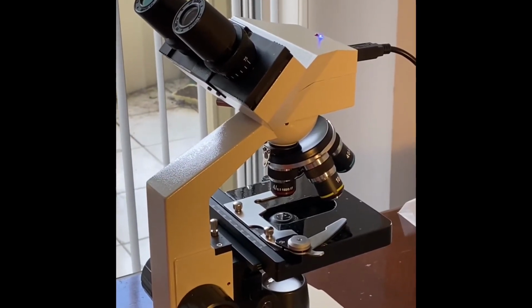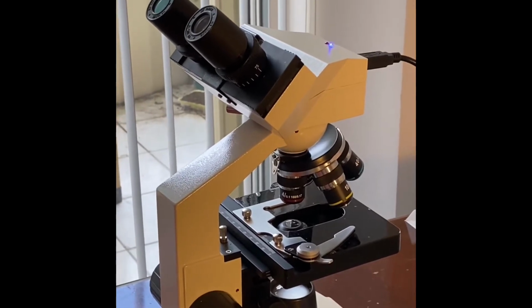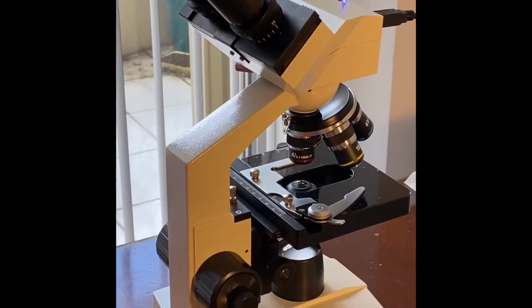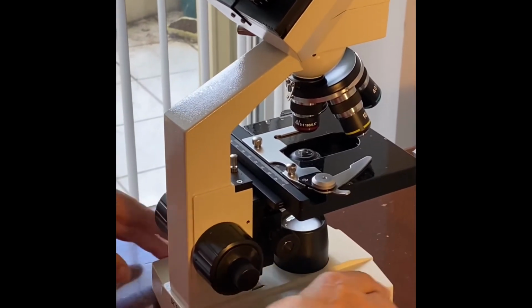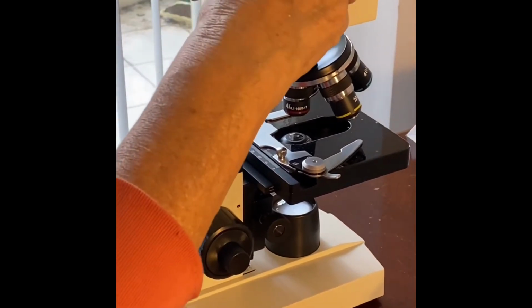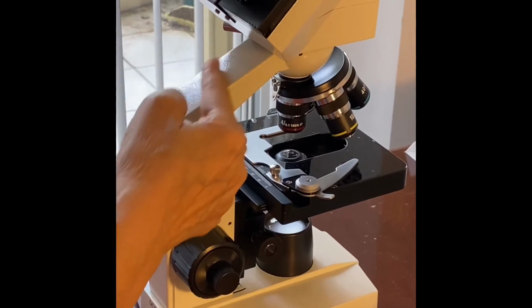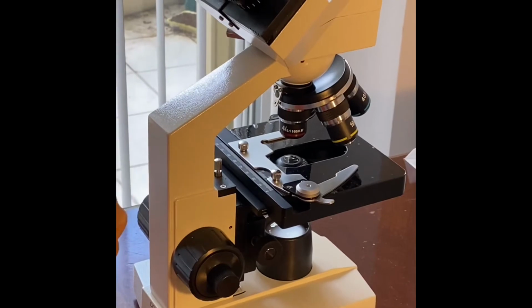Now that you have your new microscope in front of you, make sure it's on a sturdy table. As you can see, I have my microscope in front of me, and your ocular lens, which are binocular here, should be facing you, and the arm should be facing you. This is how you should have it positioned.